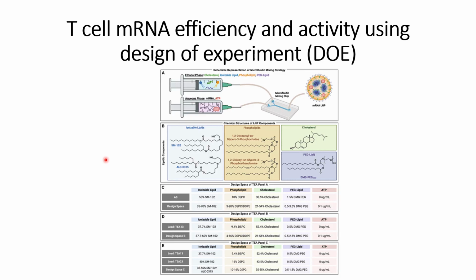At the same time, the activities, the TEA, in this case the efficiencies of the mRNA translation, are being reflected here, as they are measuring the translation of the mRNA into the final Firefly Luciferase reporter. However, the activities will be validated once they use the actual mRNA and then use those CAR-expressing or mRNA-expressing T cells against the cancer cells.